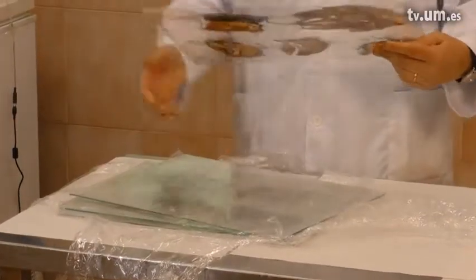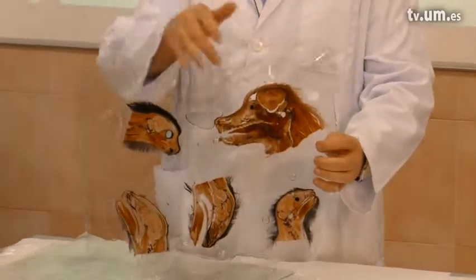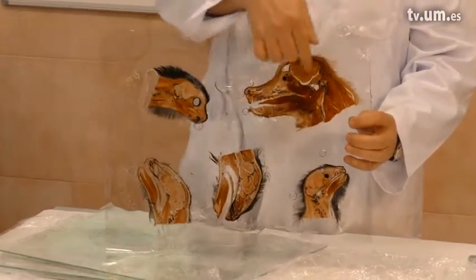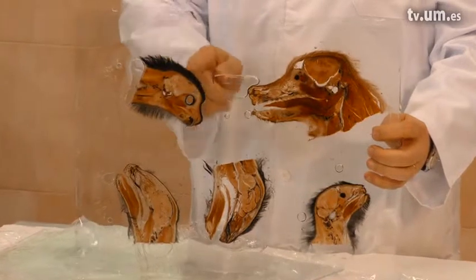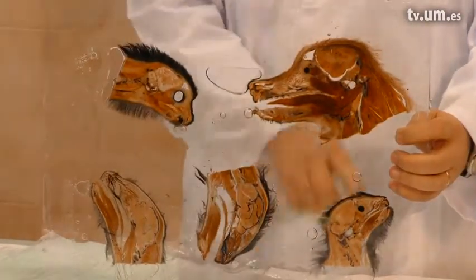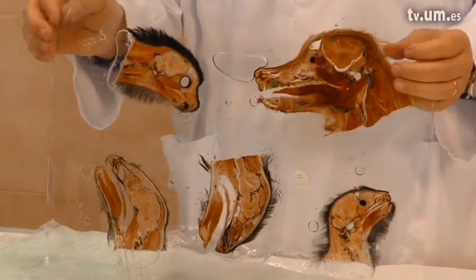The slices are between two foils. You can see there are no air bubbles on the slices, only around the slices. In the end we will cut out the desired slices from the big slice, and there will be no air bubbles on our slice.